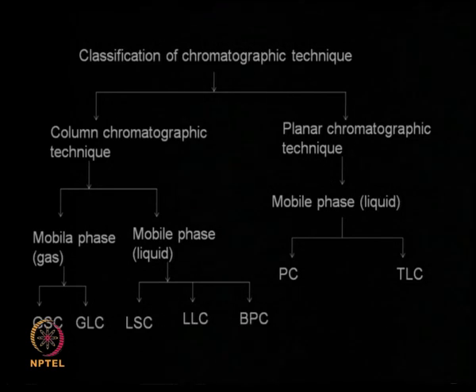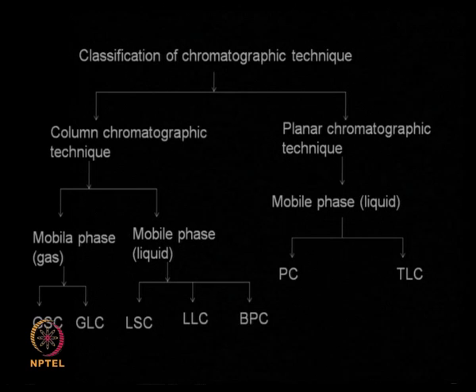It can be, in a very broad sense, a planar chromatography or a column chromatography. As the name implies, in a column chromatography we are going to use a column. In a planar chromatography we are going to have a planar surface like paper chromatography or thin layer chromatography.